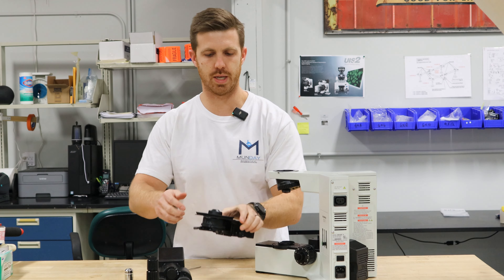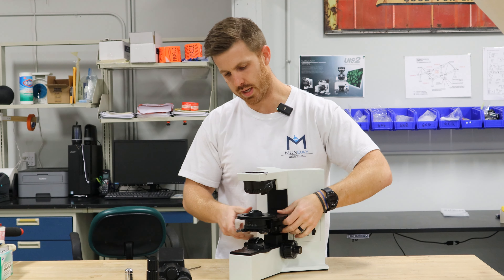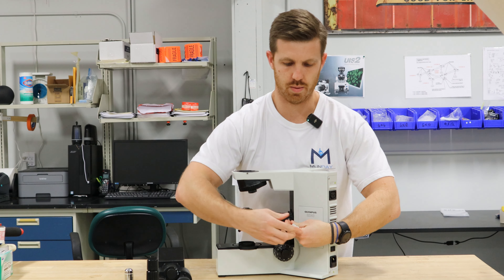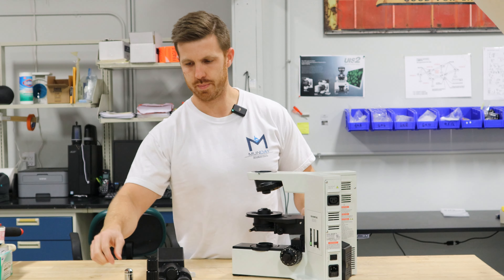So we're going to take the substage carrier, we're going to slide that right there onto that dovetail, make sure it's all the way down, and then we're going to tighten this screw up. It shouldn't slide whenever you wiggle it.